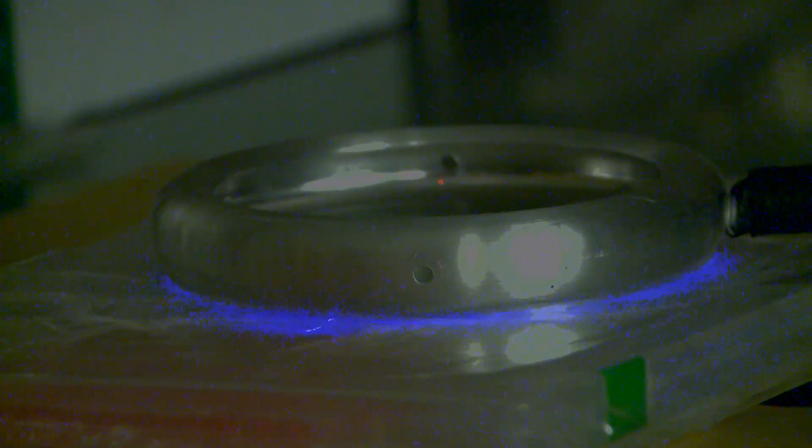Total power is about 50 to 100 watts of energy, so a light bulb or less than a light bulb of energy. Treatment times we're talking in the range of seconds to maybe a minute at most for most types of products.